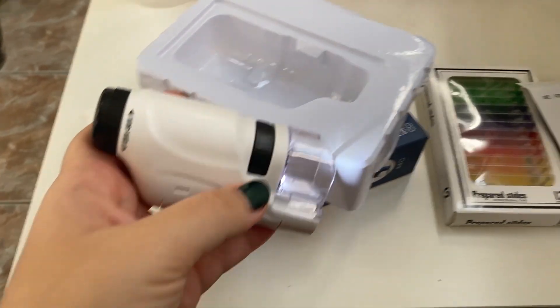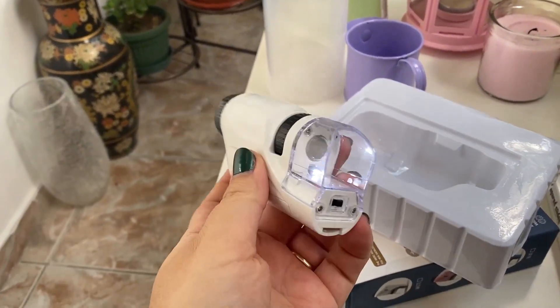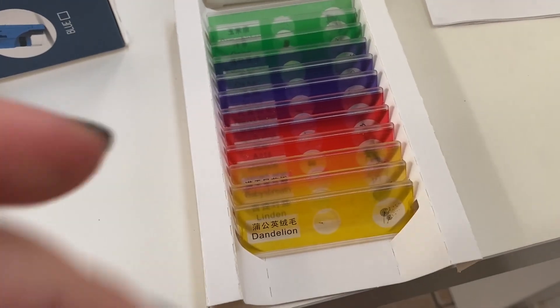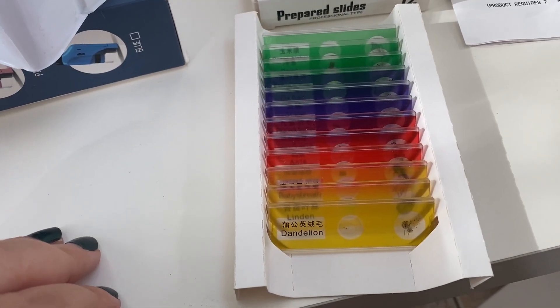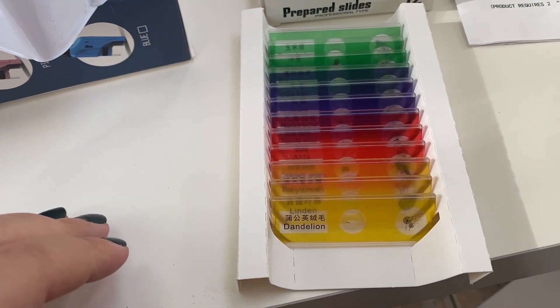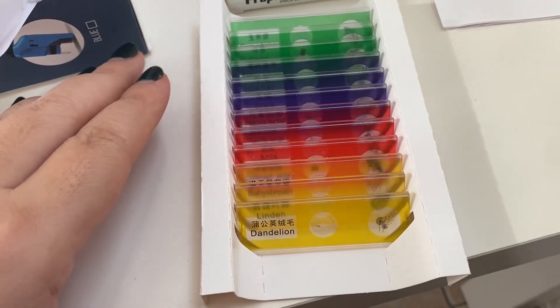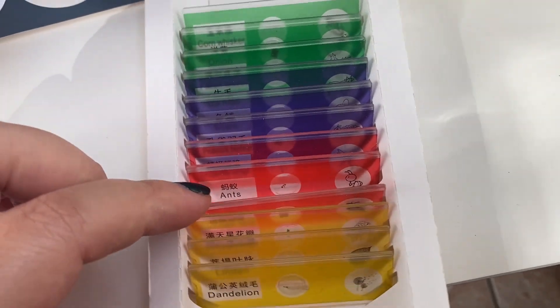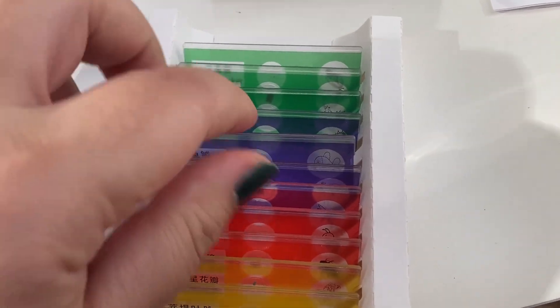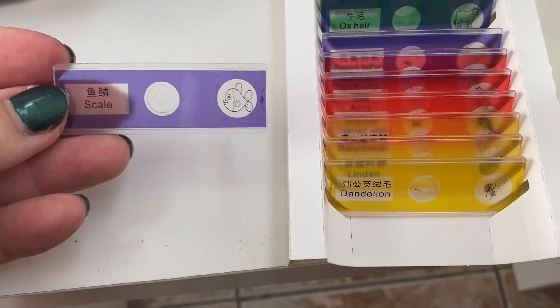Let's test it with one of the samples first, and then we'll go outside into the real world and explore some stuff. We can also explore something from my indoor garden. Out of the box I have 12 samples — they are mixed. The offer on AliExpress let you choose 12 samples from animal stuff, plant stuff, or other things, but I chose the mixed one that has everything.